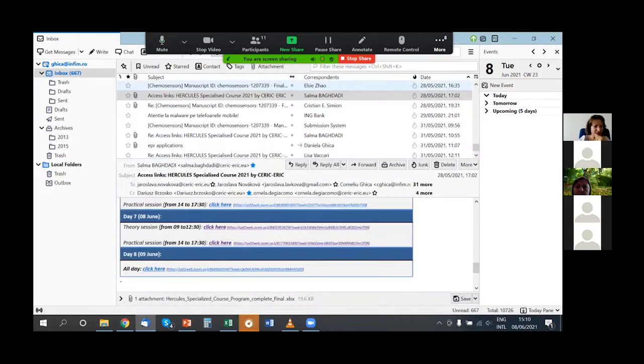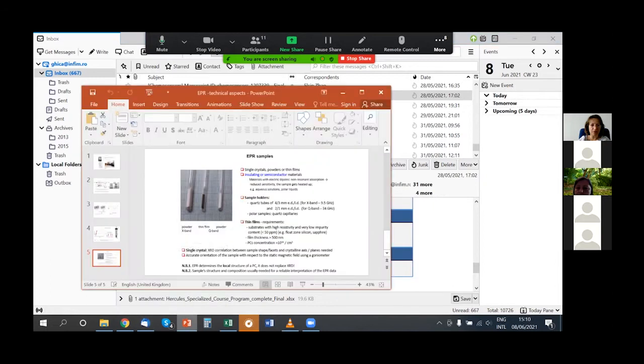So now we start effectively our practical session, and before entering the laboratory, I will present you some slides.